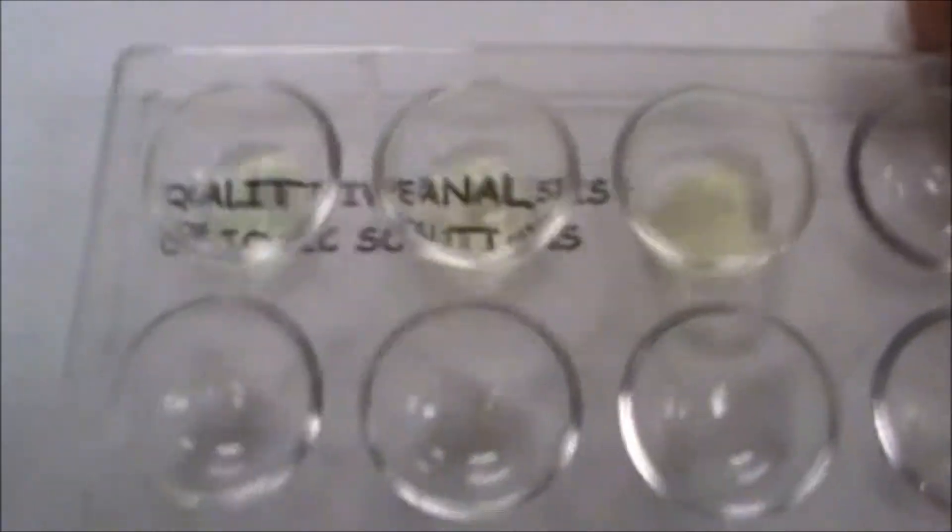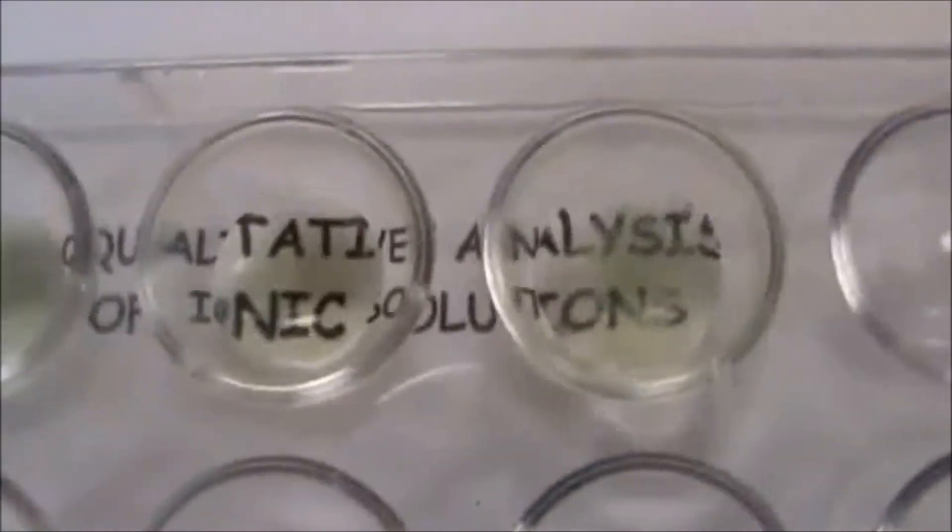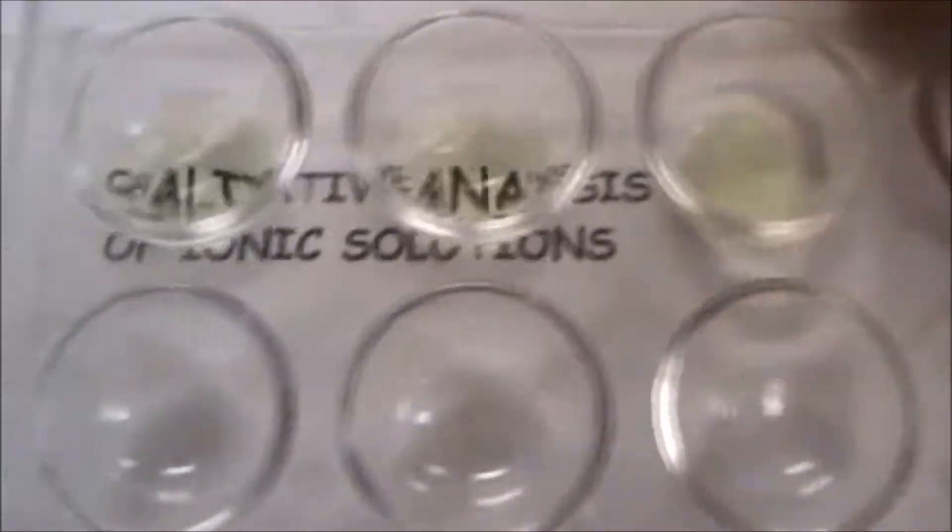That's pretty clear from there, but to kind of help show you that, if we set this on paper and then look at the letters on here, you can see those two are definitely clear, but this one is cloudy, so this one has formed a precipitate, the other two have not.